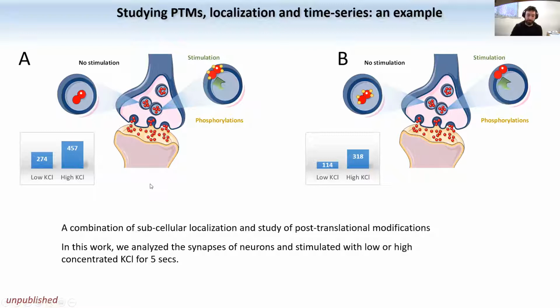And for example, you split your sample between proteins that are soluble in water and proteins instead that are soluble in organic solvent. The proteins that are soluble in water are proteins that are in the cytosol of this vesicle or the cytosol of the cell, while proteins that are soluble in organic solvent are instead proteins that are normally associated to membranes, right? Because proteins that are associated to membranes are usually very hydrophobic because they're surrounded by lipids. So usually when you purify these proteins, they're not very soluble in water.